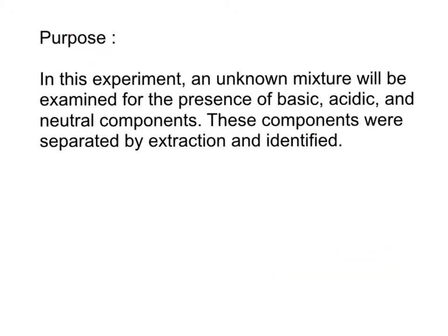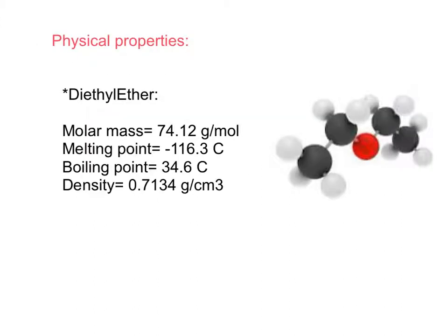The purpose of this experiment is to examine the presence of basic, acidic, or neutral components in the mixture, and these components were separated by extraction and then identified. The physical properties of the chemical substances were used.